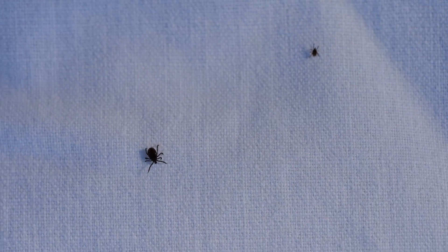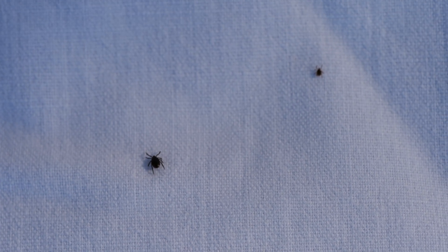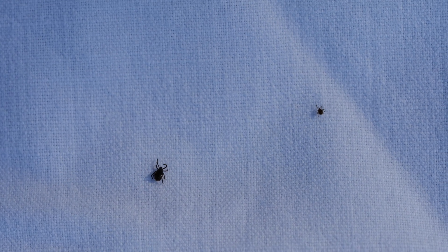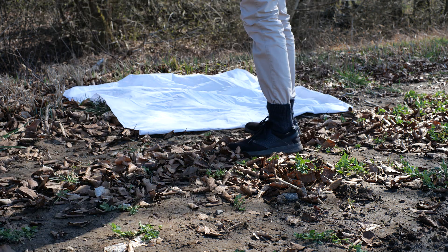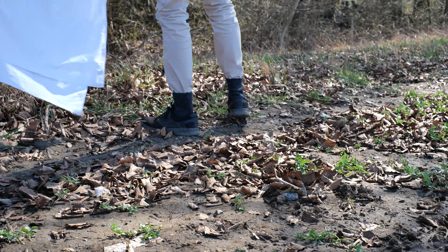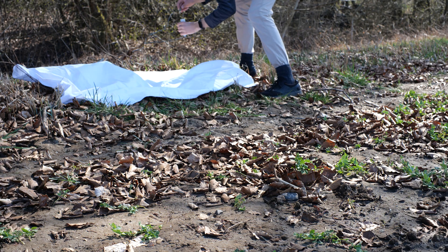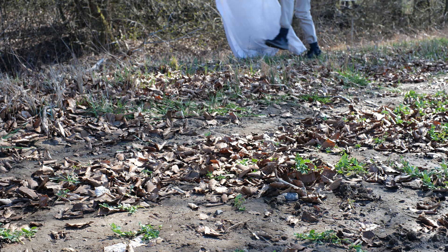Here we can see the incredible size gap between a young tick and the full-grown male. How do I know it's a male tick? It's all about the scutum — the shield-like armor on their dorsal side. It's an easy gender identifier: males have it covering the entire body, while females prefer a more modest approach, with the scutum extending only partway down their bodies. The scutum is the reason male ticks are less frequently responsible for disease transmission than females. They're stuck with small blood meals because their shell won't budge an inch. The females, however, stay attached, feed for a long time, which also allows them to transmit diseases.